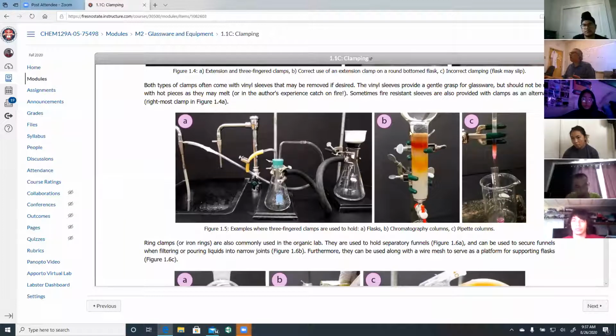This guy is called a column. And this stuff inside is silica gel. And the liquid is some kind of solvent system. And this yellow band or orange band, and this yellow band down here, light brown yellow, light orange yellow, this is a separation technique. We will talk about it later on.